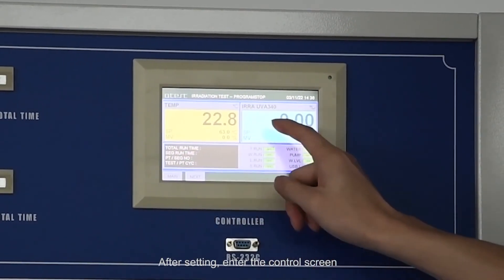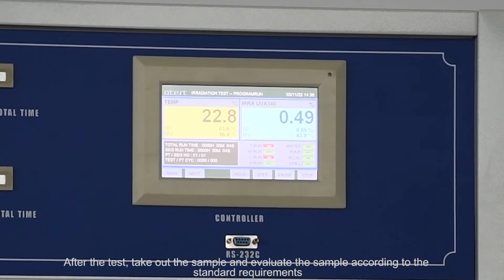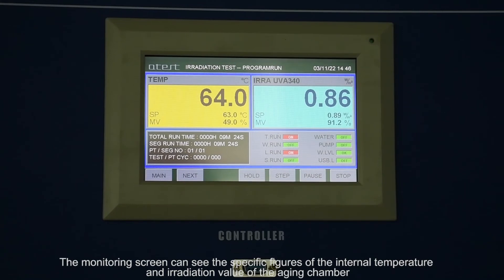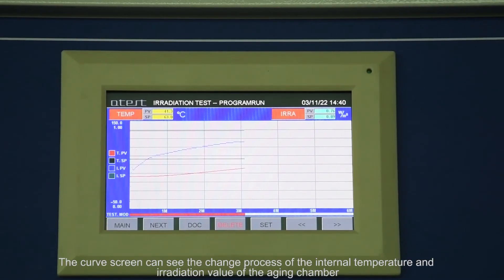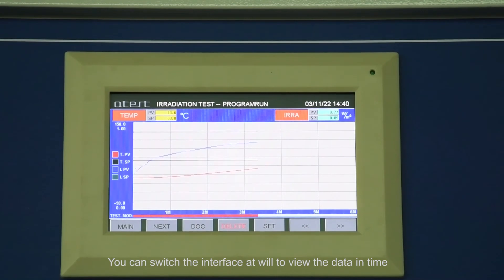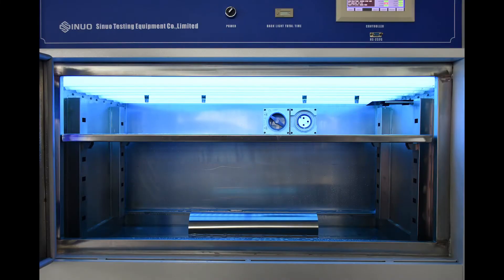After setting, enter the control screen and click run to start the test. After the test, take out the sample and evaluate it according to the standard requirements. The monitoring screen shows the specific figures of the internal temperature and irradiation value of the aging chamber. The curve screen shows the change process of these values over time. You can switch the interface to view the data as needed.